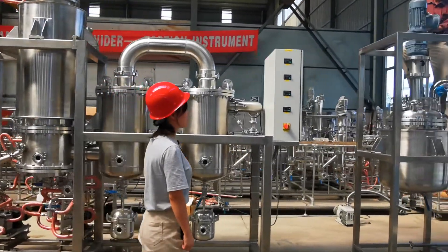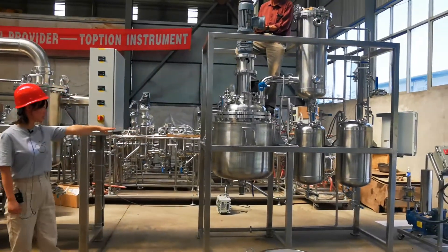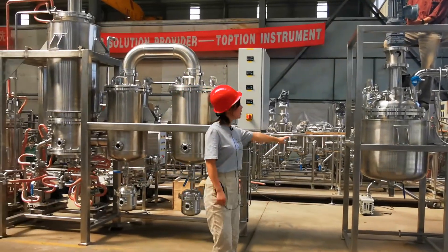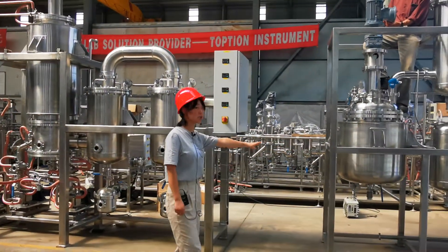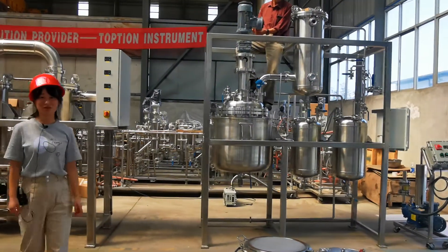And the final step is our recrystallization reaction. It's our recrystallization filter reactor. That's all. Thank you.